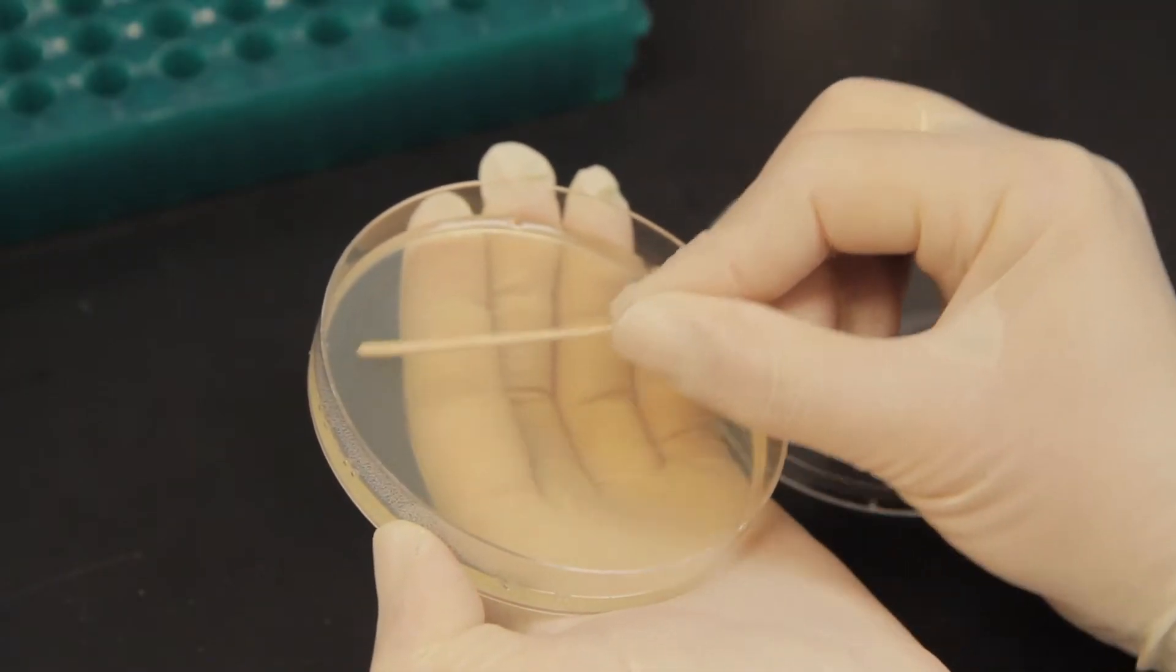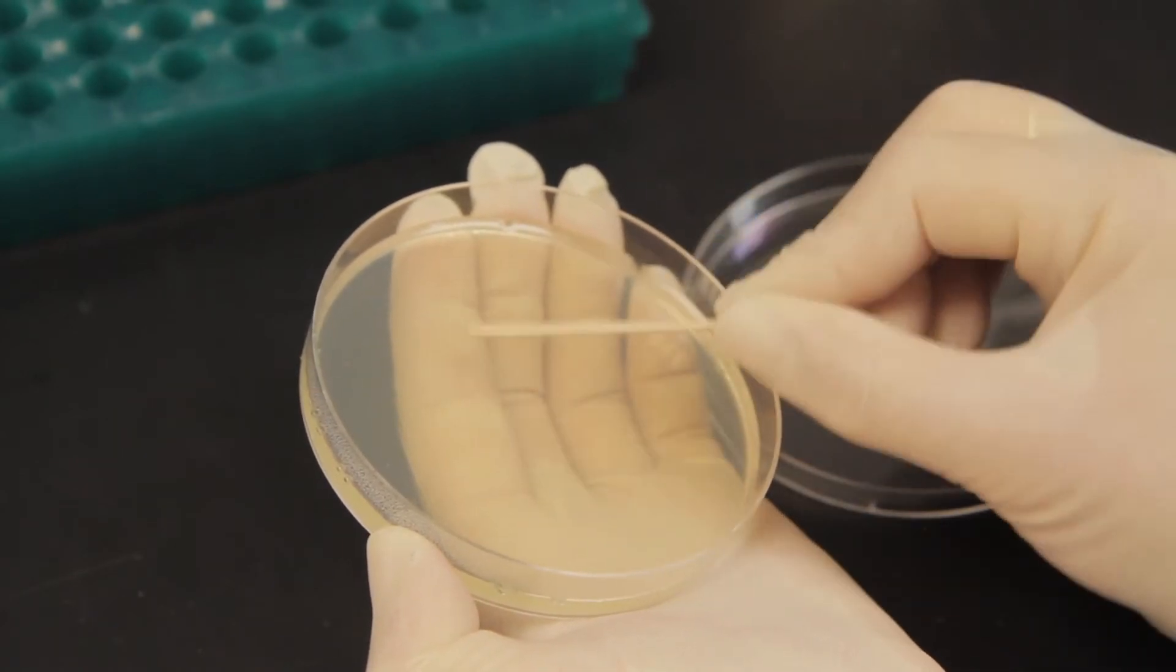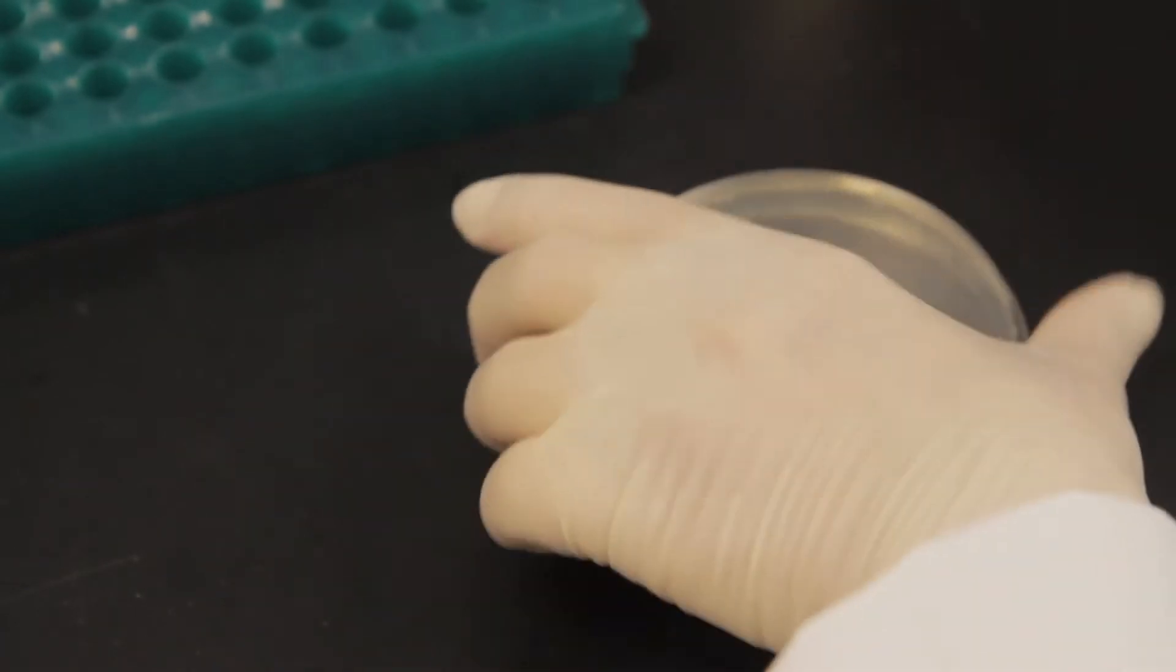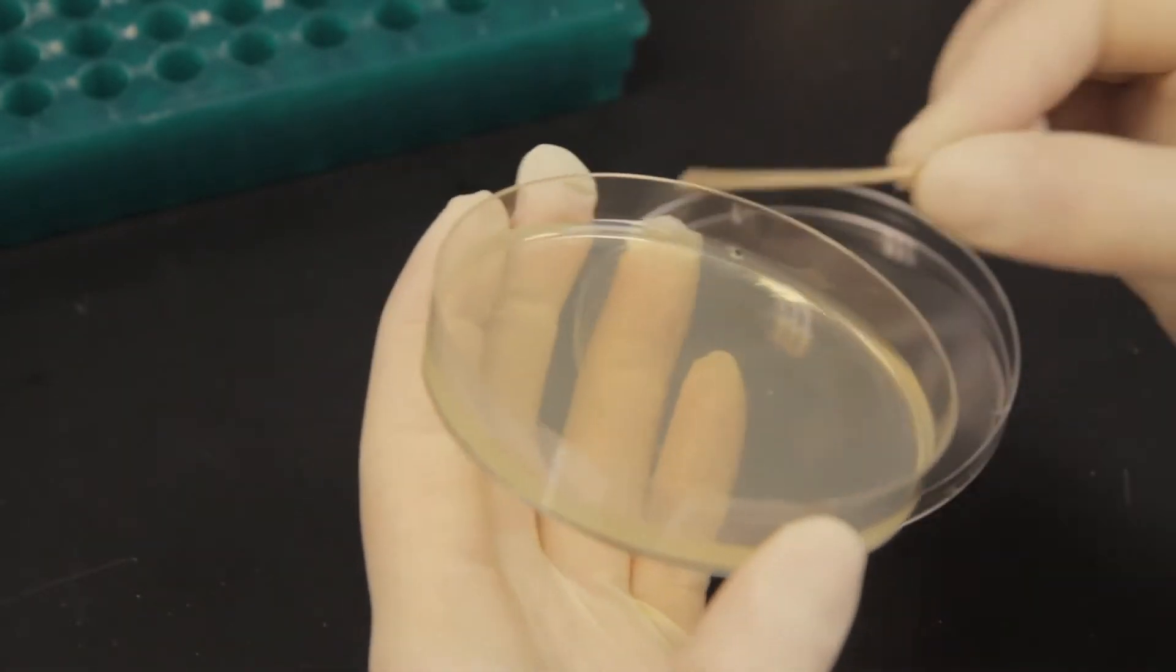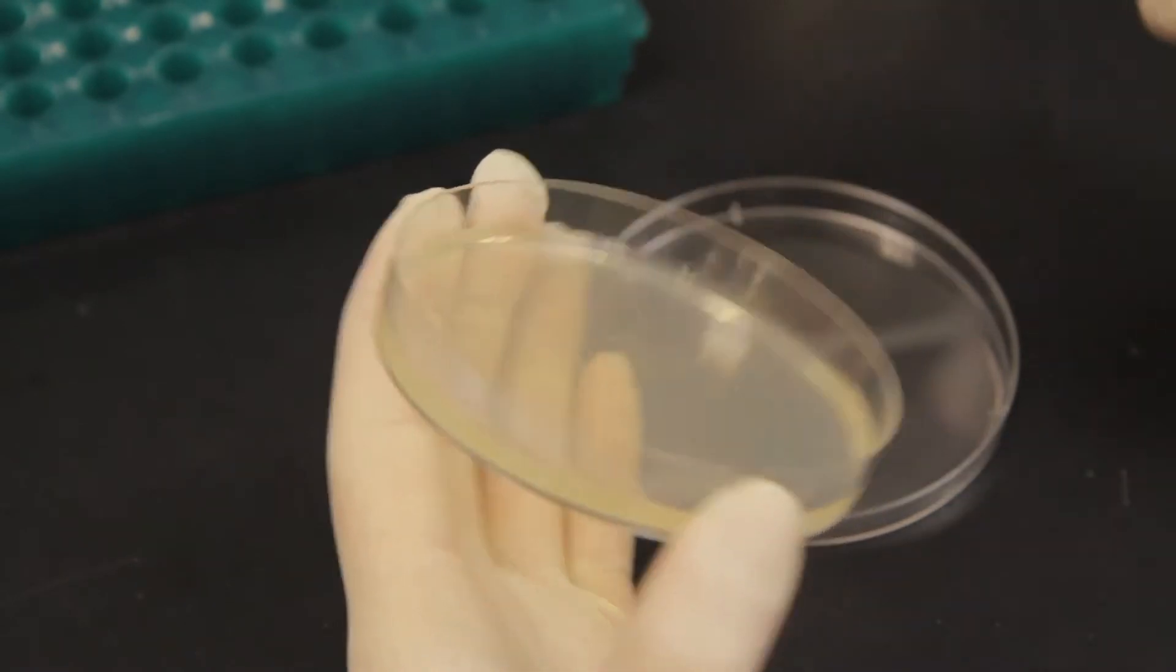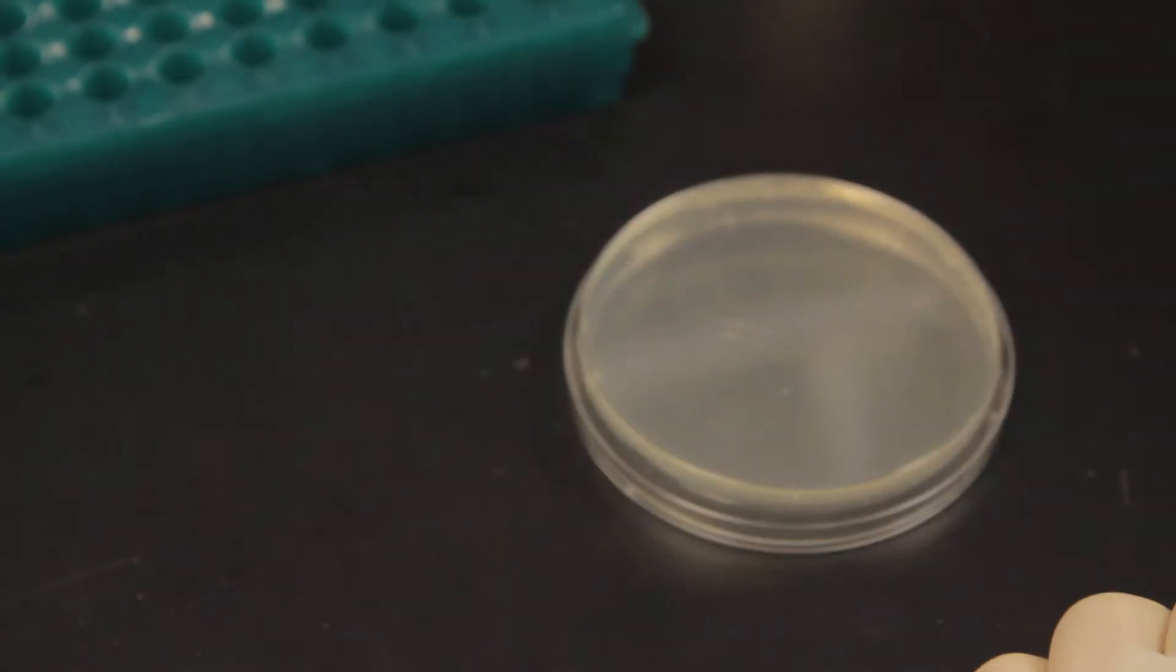Using a new toothpick, drag through your first streak to pick up some bacteria, and then create several new streaks on a fresh part of the plate. Finally, drag a fresh toothpick through the second streak and create a final streak on the last part of the plate.